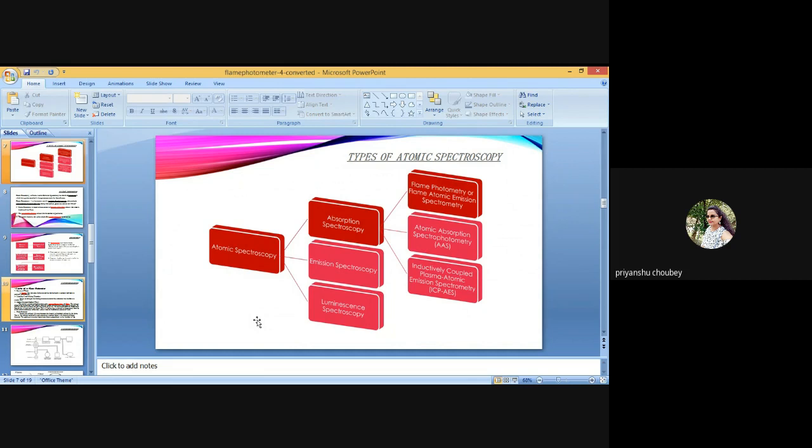Preparation of sample for ICP-AES. The digestion procedure for soil and plant samples for total element analysis by ICP-AES is similar to that used for various emission instruments. Universal multi-element soil extraction can also be used for the extraction of a soil sample.